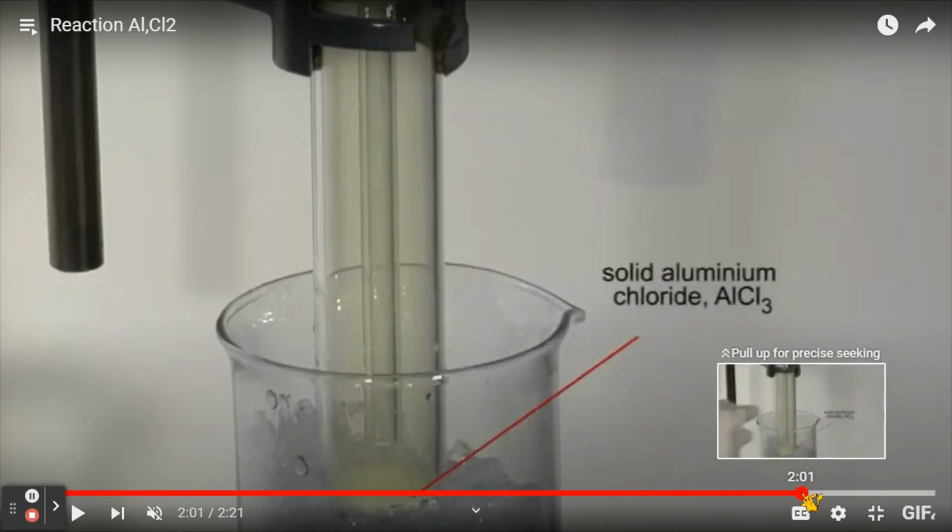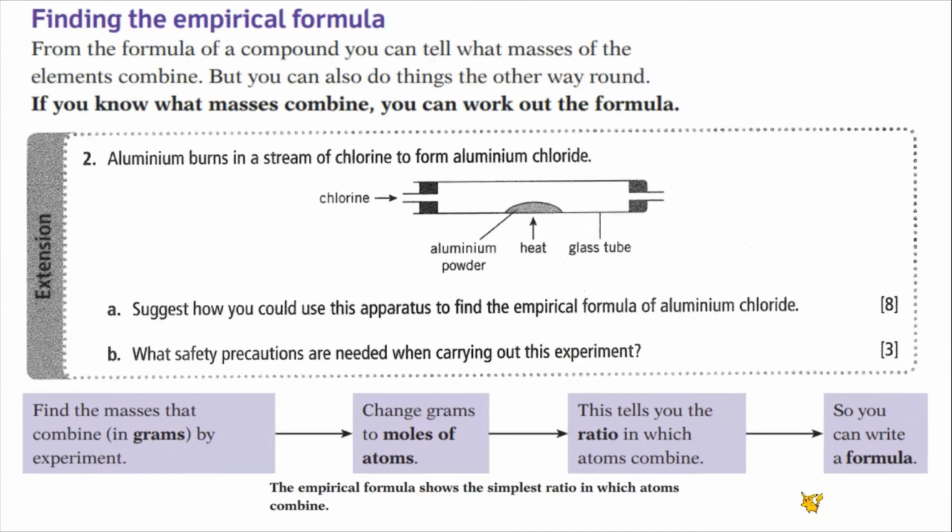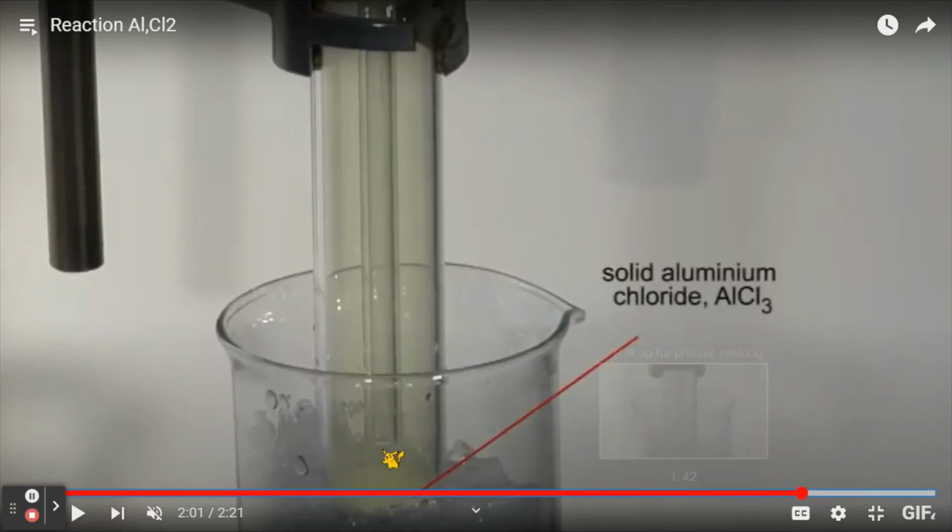So it's a beautiful yellow color. Now, if you were to do this experiment using realistic levels of apparatus, you would also need to weigh the test tubes, all of the bits of apparatus that's connected to the glass tube, because as you realize, the aluminium chloride is escaping from the glass tube. In order to make sure that our calculations are accurate and closer to the real true value of the empirical formula of aluminium chloride, you'd actually have to weigh and then take into account any differences, because any gains in mass in the rest of the apparatus is due to the aluminium chloride.